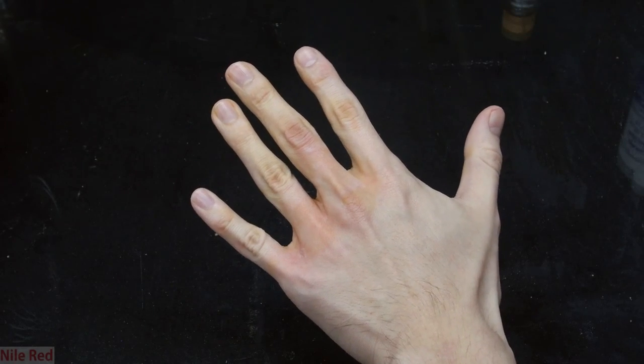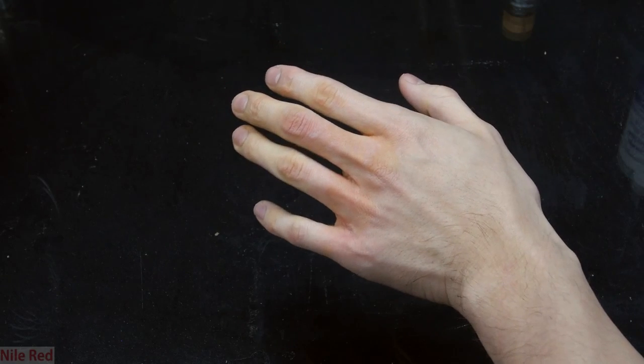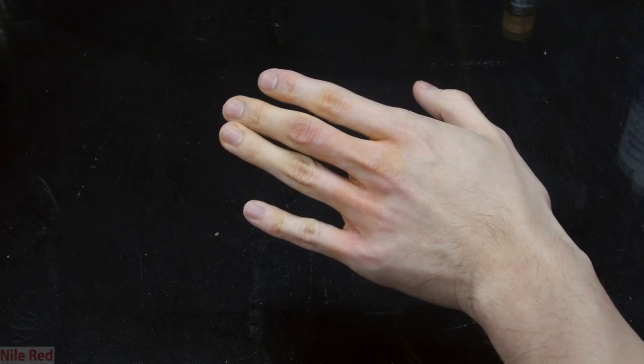This is my hand and you can see that it's a little bit red but there's a lot of yellow. As I said before, nitric acid reacts with keratin in your skin and when it does this, it turns it yellow.